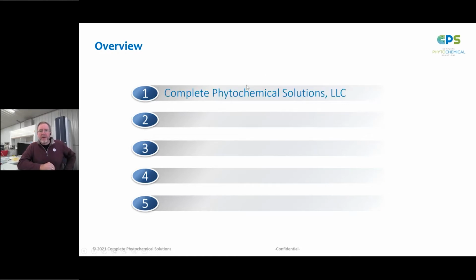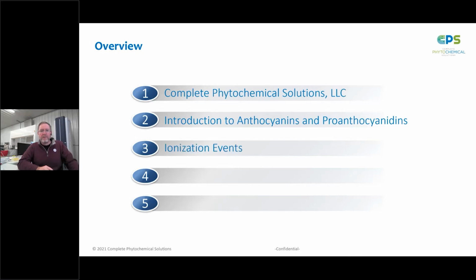I want to give a quick introduction to the role of CPS and what we do for the industry: food, beverage, dietary ingredients. We'll give a quick introduction to the anthocyanins and proanthocyanidins, two polyphenol groups that are important constituents in, again, foods, beverages, and ingredients. I'm going to talk a little bit about the ionization properties of polyphenols.